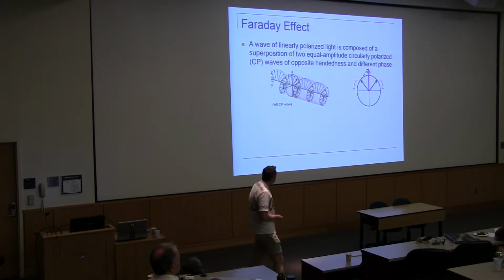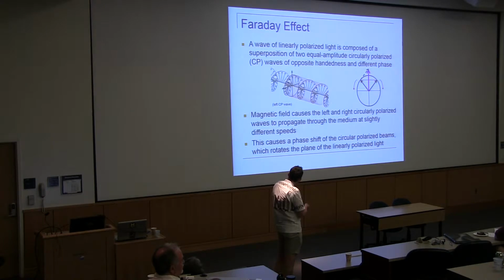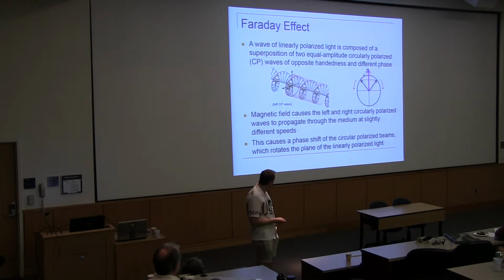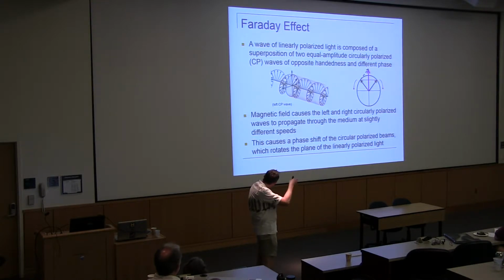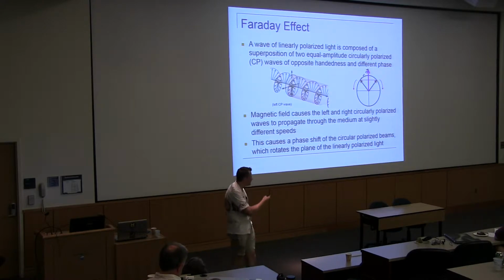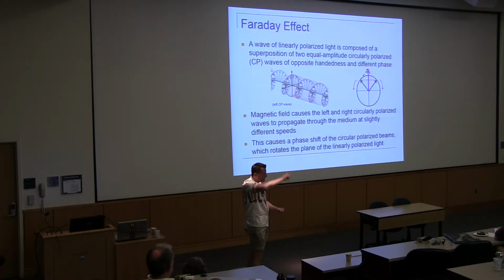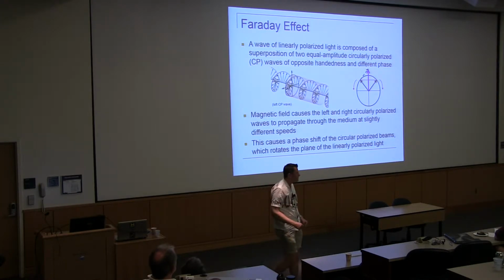As you rotate this down, at 180 degrees the two just compensate for each other, so the resulting electric field vector is 0. Then as they travel down, the vector points in the other direction. So it looks like it oscillates in that plane: the electric field goes up, then to 0, then down, and up and down. That's what it looks like.